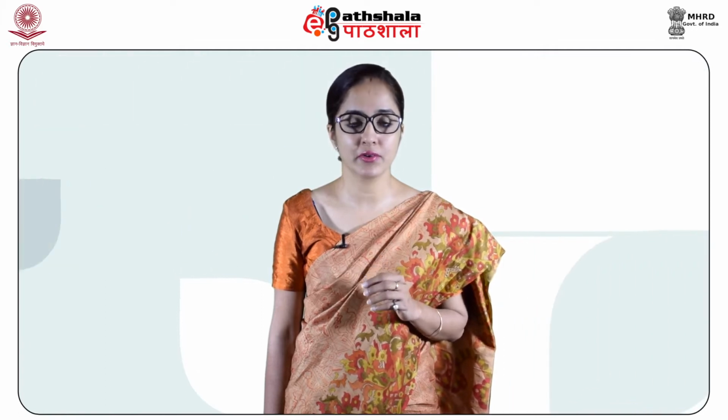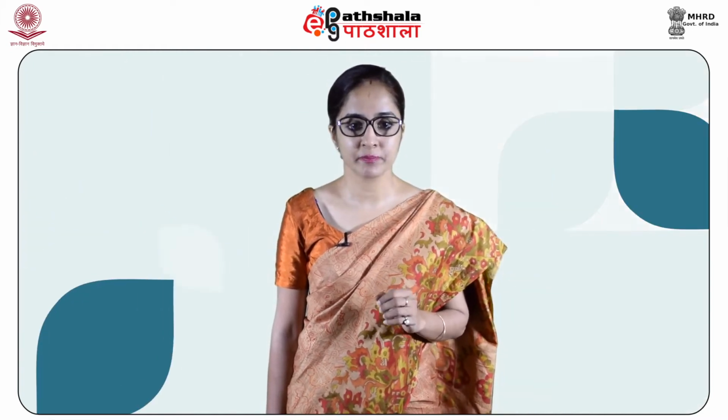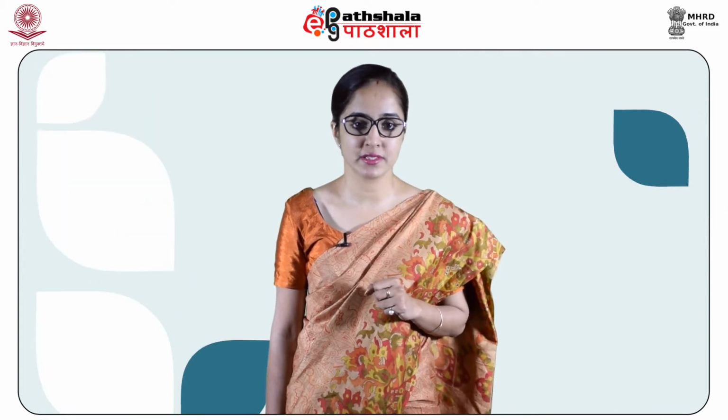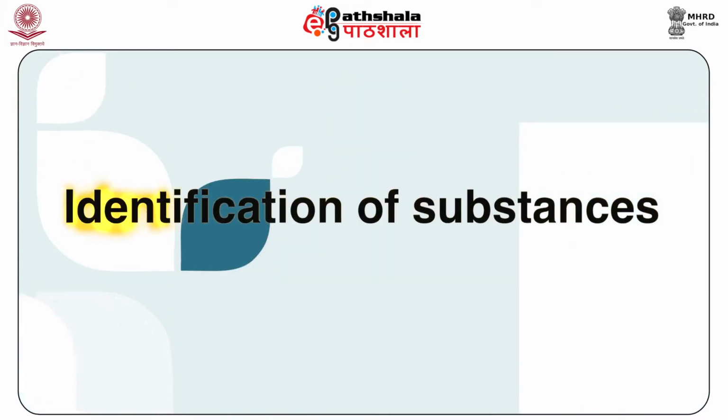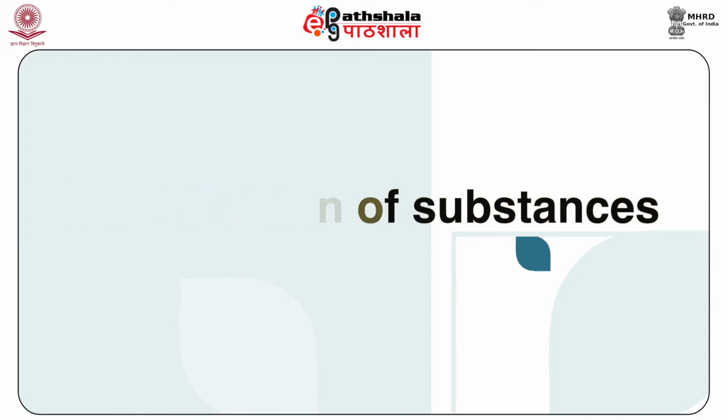The presence or absence of absorption in the carbonyl region, that is 1870 to 1650 cm⁻¹, or the hydroxyl region which ranges from 3700 to 3200 cm⁻¹, can serve to ascertain that some of these possibilities may be present. It is thus possible to establish a correlation between IR absorptions and functional groups which may be present. Now let us get along with identification of substances as our next topic of discussion, students.